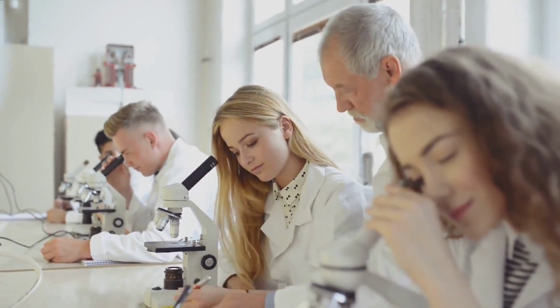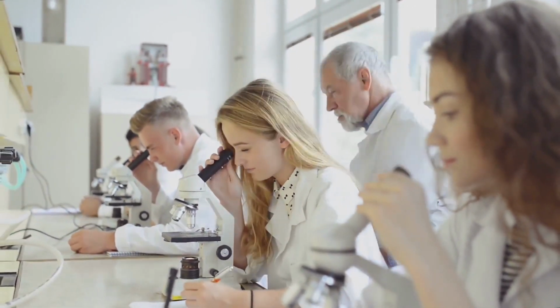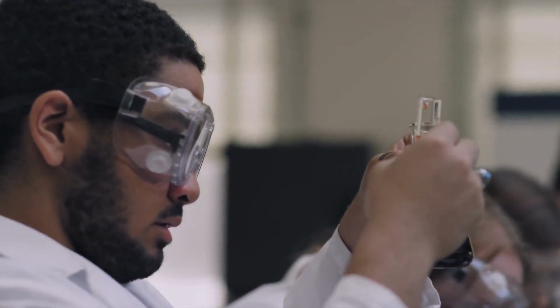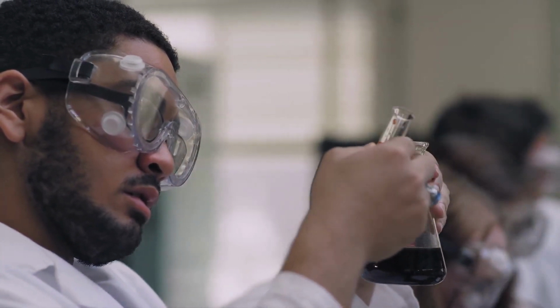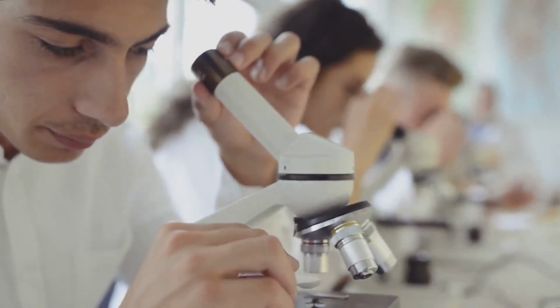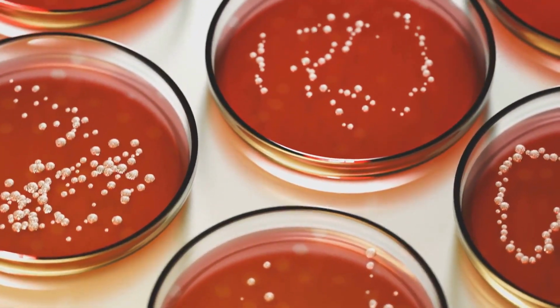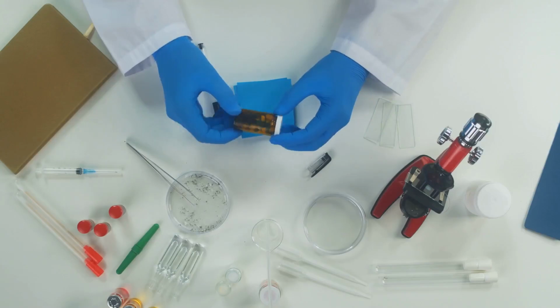The first section of your microbiology laboratory focuses on some foundational concepts and practices used in microbiology laboratories. You begin with laboratory safety so that you are equipped to properly and safely work with the microorganisms to be studied in future sections. You also spend some time getting familiar with tools and equipment employed by microbiologists, including the microscope, media used to grow bacteria, and the tools used in the collection or transfer of microbial samples.